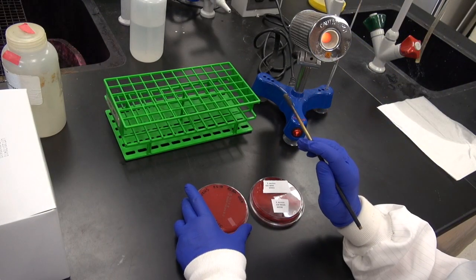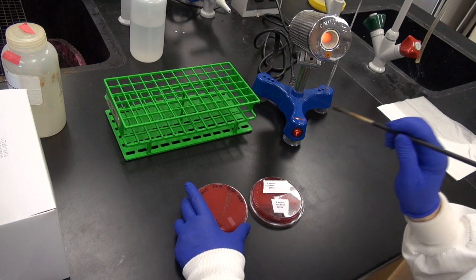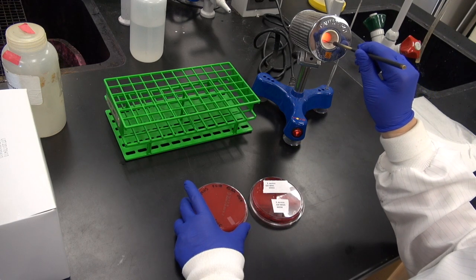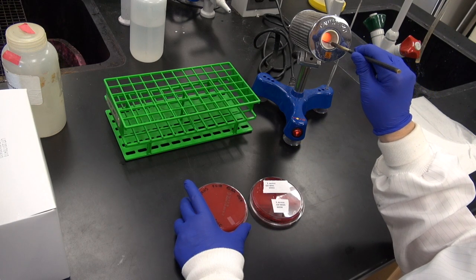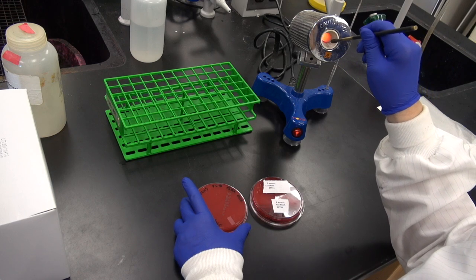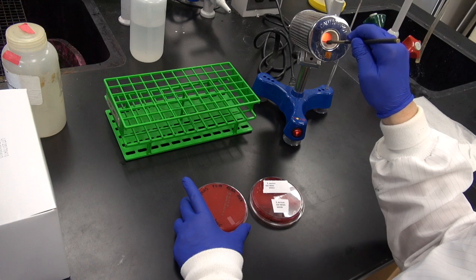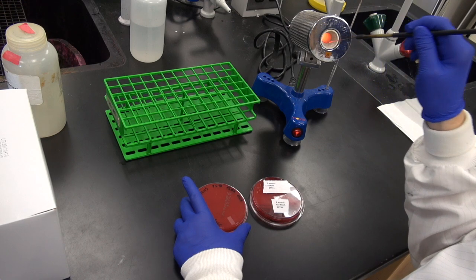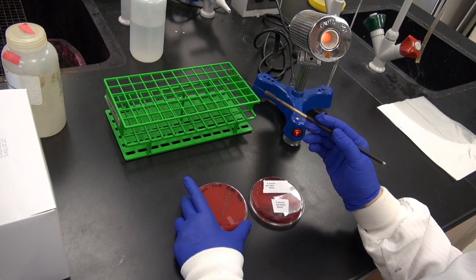To begin, we first place the wire loop inside the incinerator to sterilize it, holding the loop in our dominant hand. We don't want any bacteria from the environment to contaminate our new plate. The loop should be heated until it glows orange.